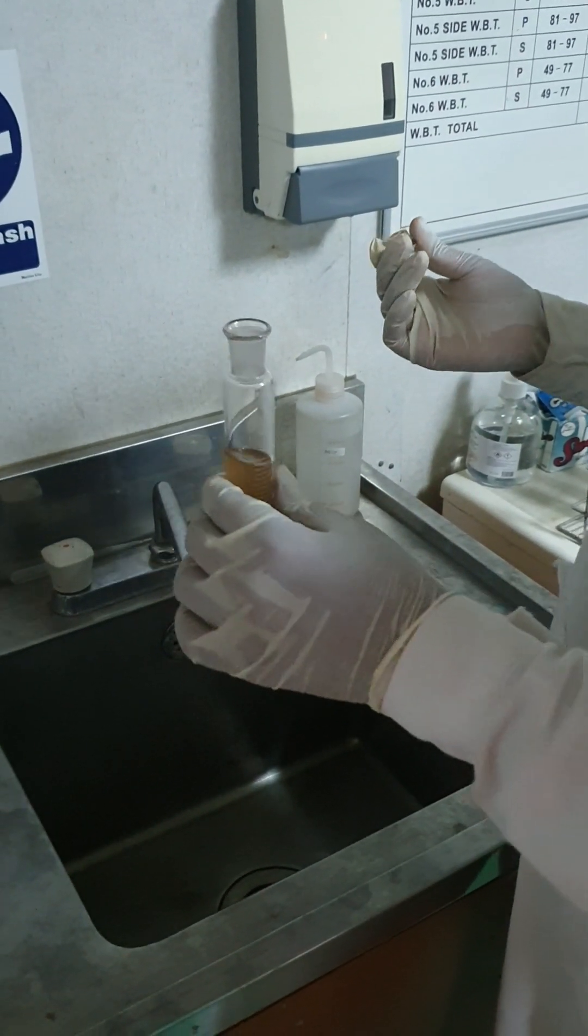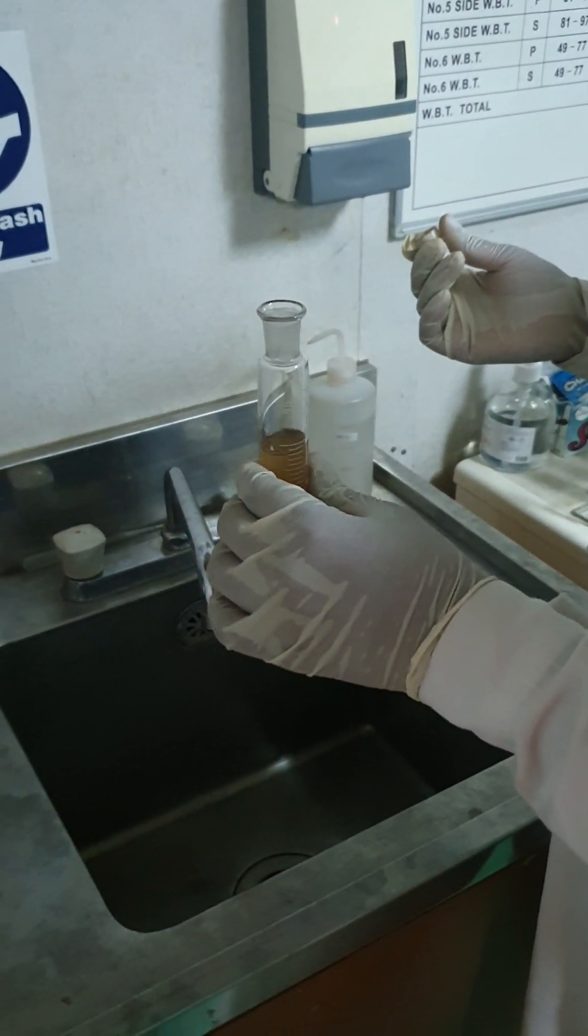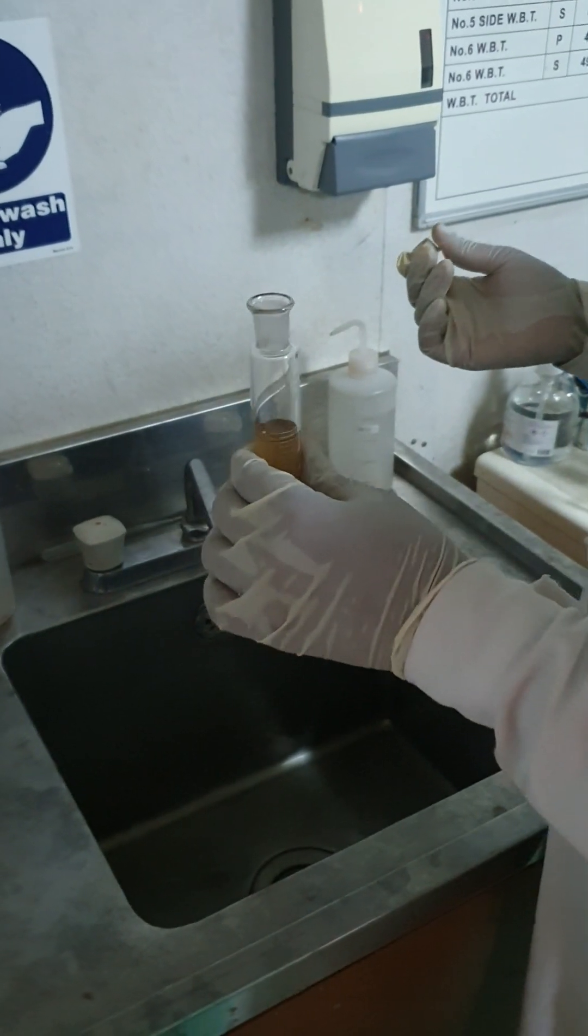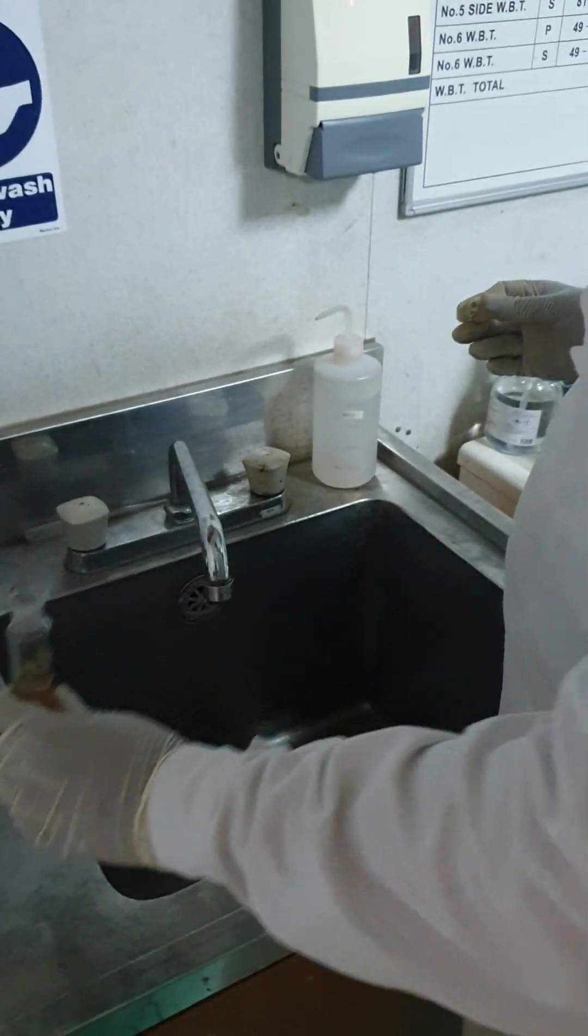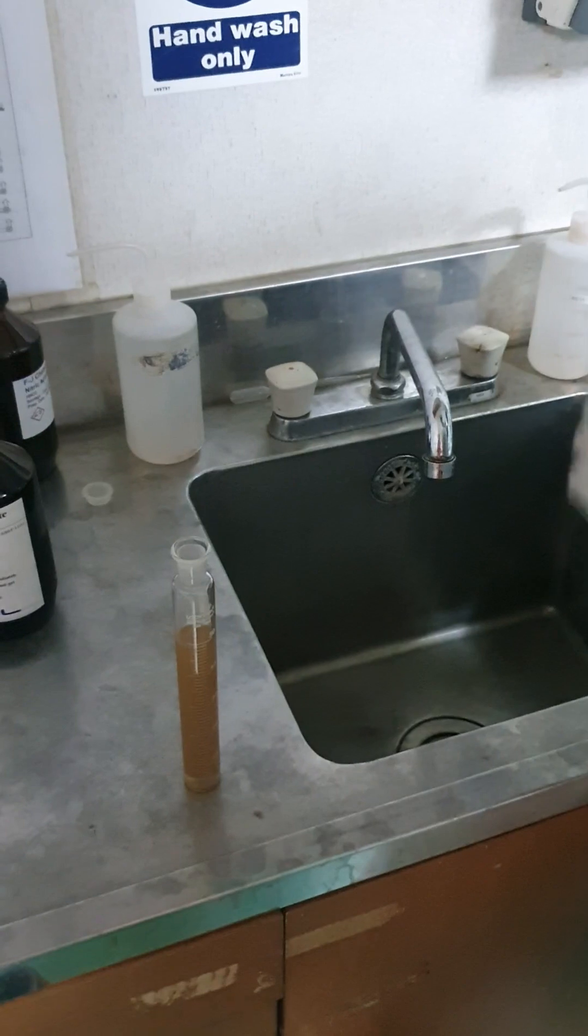Like normally for the methanol, they will give 30 minutes, for the 50 minutes for the 20 degrees Celsius or something like that, if you are loading the cargo from the Middle East area.